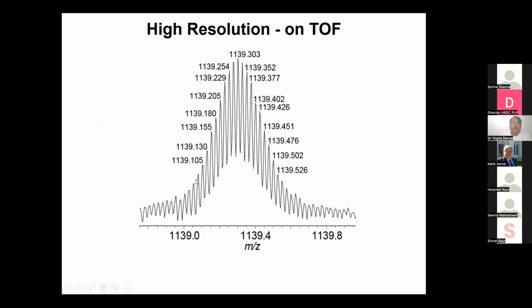See here, this time of flight analyzer is able to distinguish very close masses, a very close resolution, which is possible only with the time of flight analyzer.